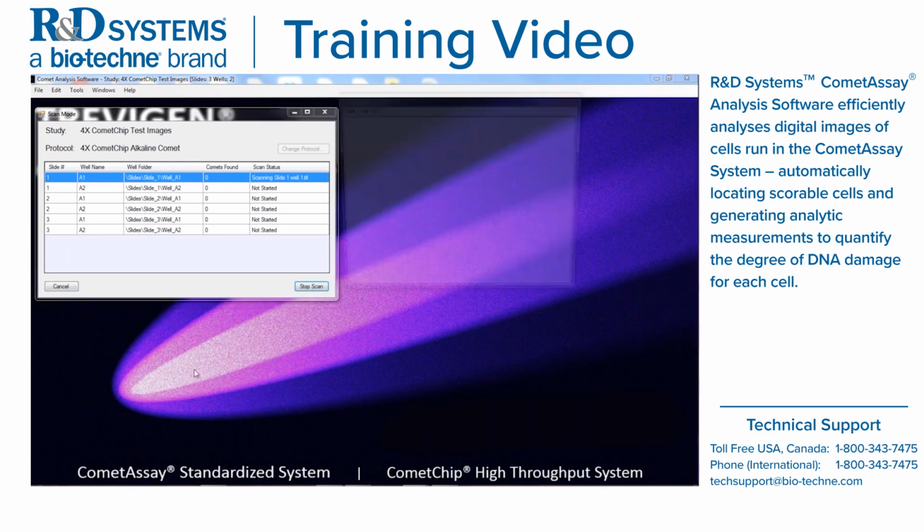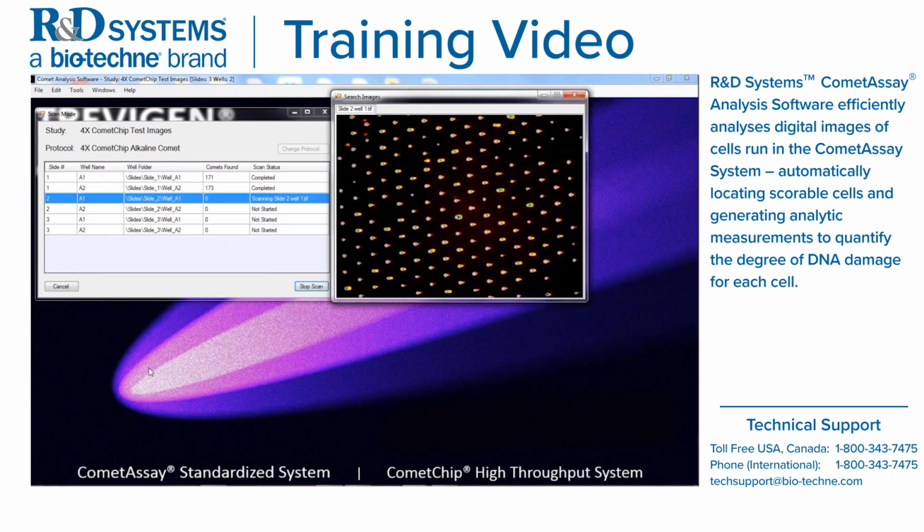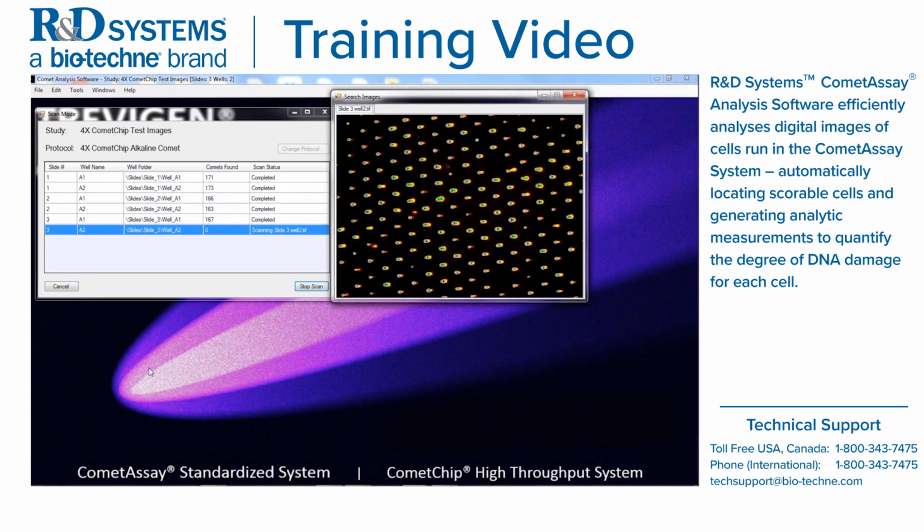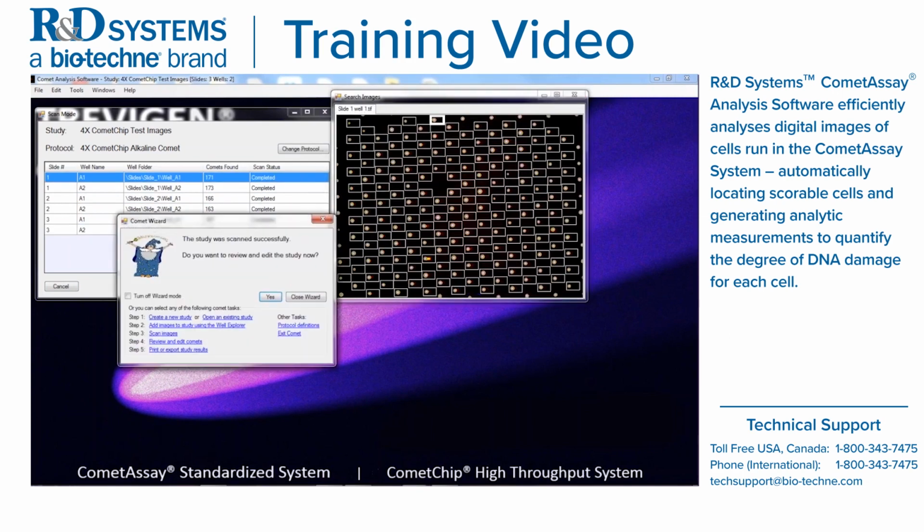So each of our TIFF images are being brought up, and you're seeing these white boxes which are identifying all of the scoreable comets within that image. So the images I actually chose were based off of CometChip technology. These were 4X images that were actually taken.